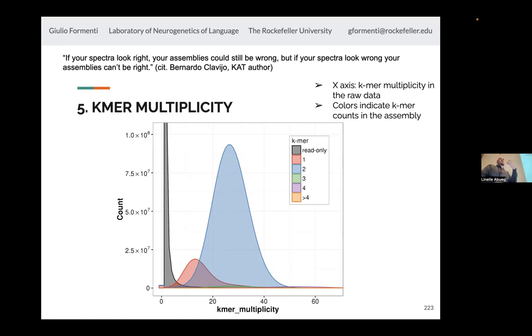Sometimes it's because we were always talking about sequencing errors as an average. On average there is that amount of sequencing errors, but it can happen that just by chance during sequencing a bit more errors are introduced when reading a particular region. It's a stochastic fluctuation. If that happens, this fails to be recognized as an error because it's too high compared to what you would expect. So you say, oh, it's not errors, this must be something real because it's too high. That's one possibility.